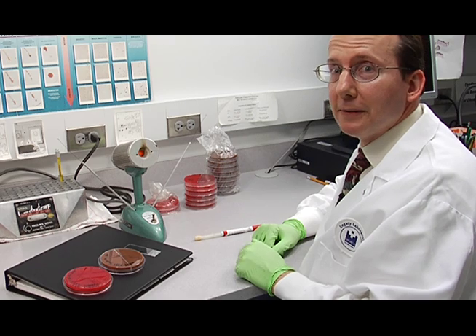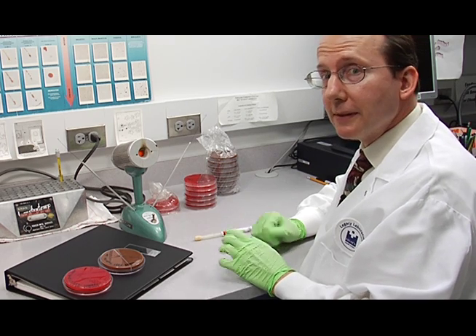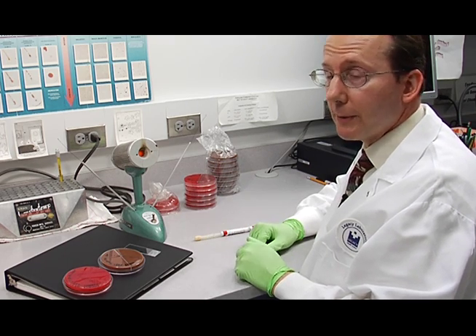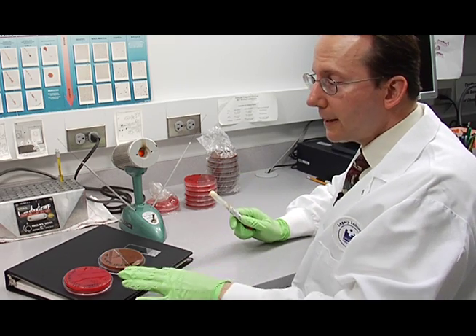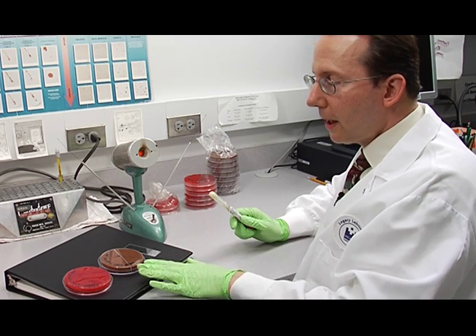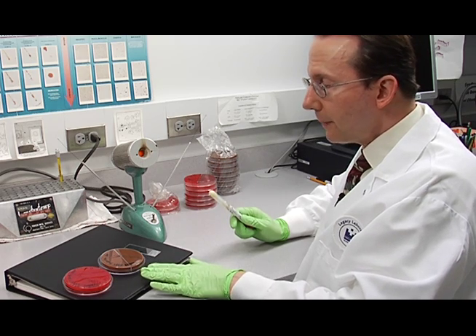Now I'll show you how to set up a female genital tract culture. This is another example of a primary or direct culture. We'll be using a swab, and we'll set it up on a blood agar plate and a Martin Lewis chocolate bi-plate.